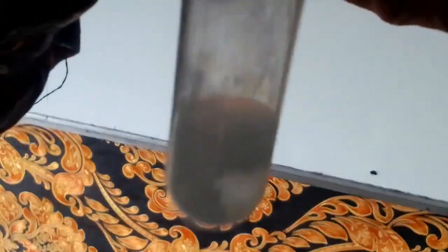So we're going to add more ammonia into the chalky white solid, which is called a precipitate, and see what will happen. We're adding more ammonia in excess. You see that it remains insoluble. It is still chalky white in color. So we'll now go to the board. We added in drops to this E aqueous, and we obtain white or chalky precipitate formed.